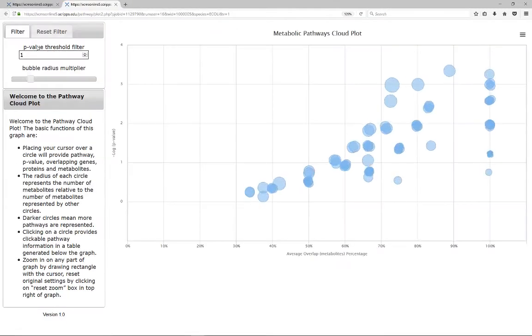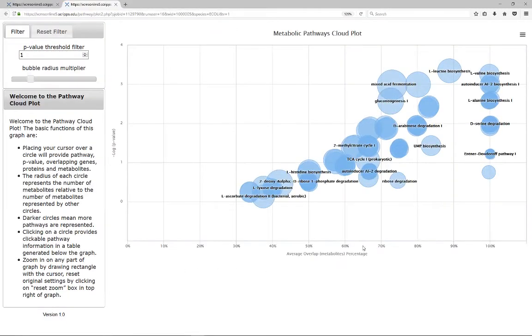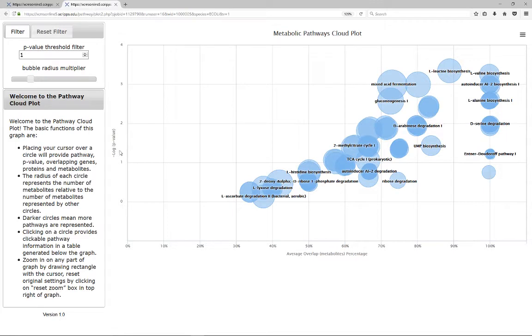In the pathway cloud plot, the percentage of overlapping metabolites is on the x-axis and the negative log p-value is on the y-axis. Each metabolic pathway is represented as a circle in the plot. The radius of each circle represents the relative number of metabolites observed for a given pathway.